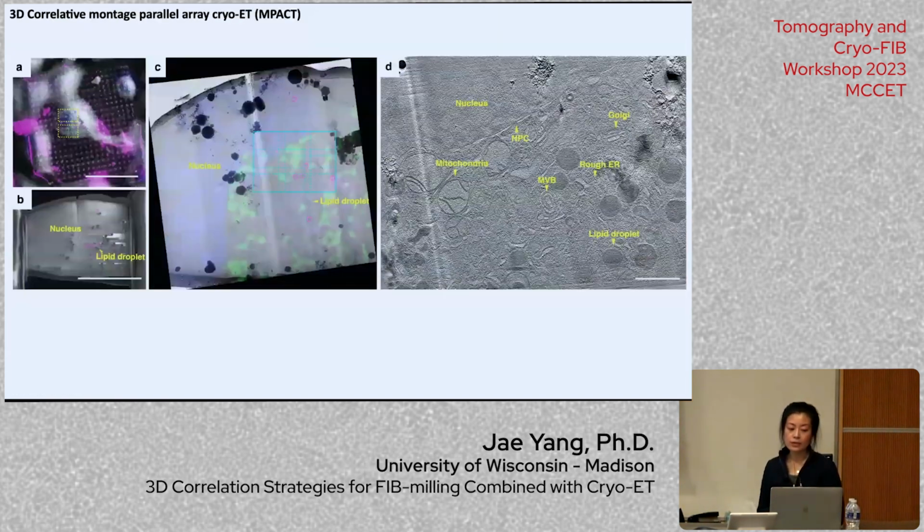And then we also applied this same method combined with what our lab developed, called Montage parallel array cryo-ET. We are doing the montaging because, as people mentioned, the limited field of view makes the imaging harder and harder. So we wanted to know how we can capture a larger field of view as well as preserve the structural information, because you do not want to lower your magnification.